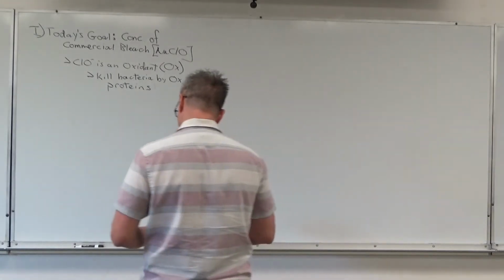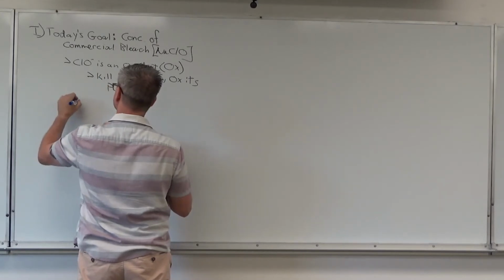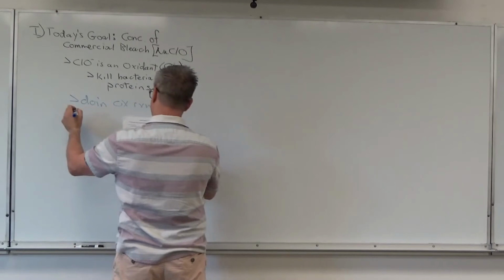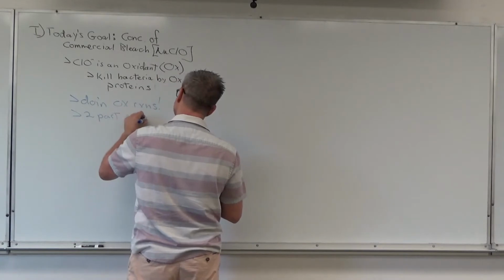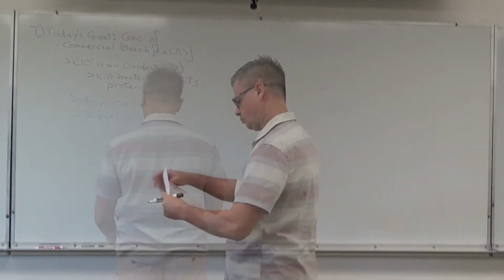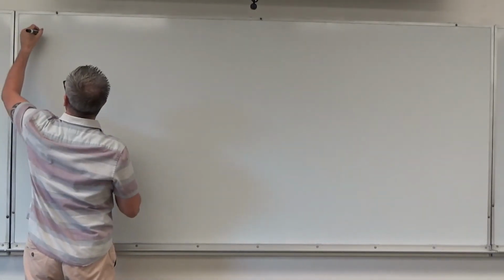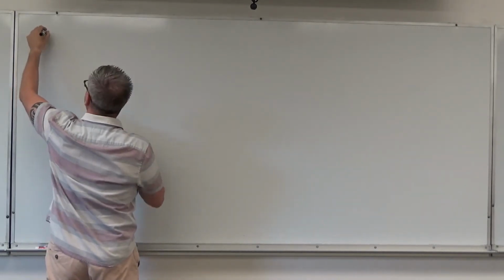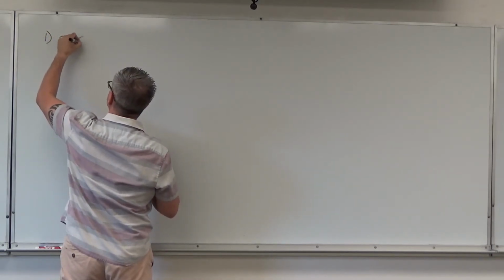Let me put some stuff on the board. Okay, so oxidation reactions, a 2-part process. The first redox reaction, which is an oxidation reaction, is going to be the oxidation of I minus.